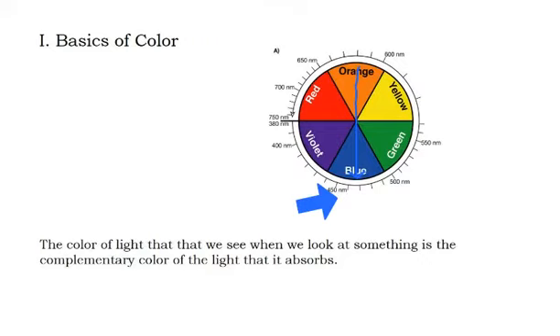So we'll start here in this edge of the red. Get my pen to write in blue here. We'll start in the violet edge of the red and draw a line straight through the center of the color wheel, and we end up in the green. And if we look at the wavelengths there, that's going to be somewhere around 550 to 560 nanometers in wavelength. So those are the two compounds that we synthesized, and those are the wavelengths that we predict that they would absorb. The orange compound will be somewhere between 450 and 500 nanometers. The rose compound will be somewhere around 550 to 560 nanometers.